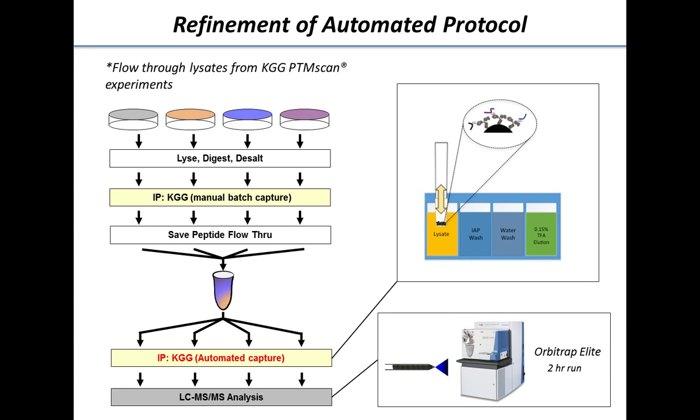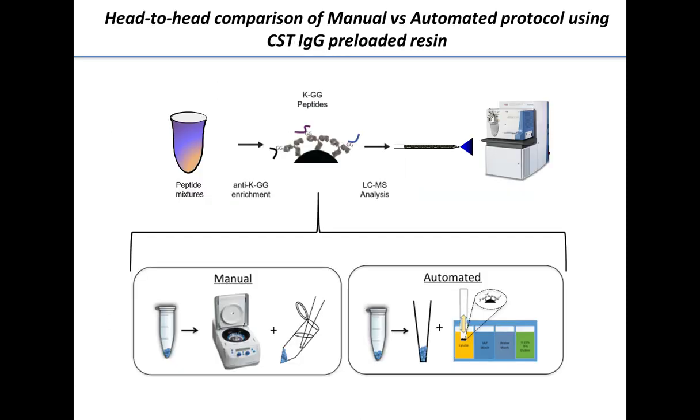Once we had optimized some conditions using the simple platform, we moved over to looking at samples that were more representative of real-life samples. And to do this quickly, we ended up asking members in the group for their leftover lysates from their experiments, and we ended up pooling these lysates and using that as our input for the rest of these experiments. And LC-MS analysis for this method development project was all done on our Orbitrap Elite mass spec to save precious time on our Lumos systems.